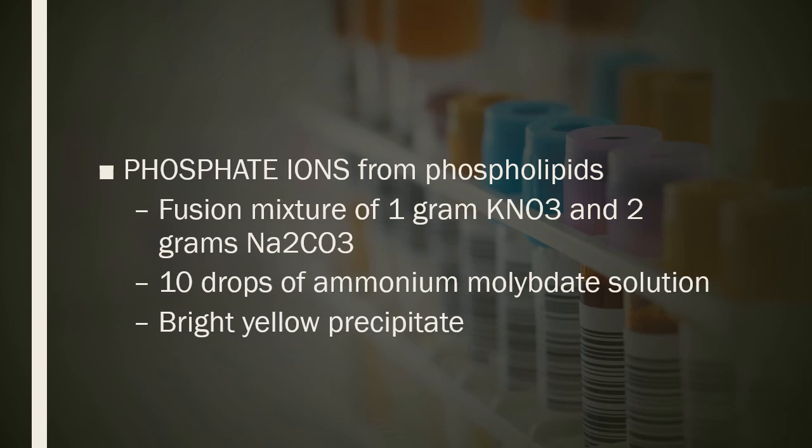After that, you added water and filtered it again. You take the filtrate, and in the filtrate you added a few drops of ammonium molybdate solution.